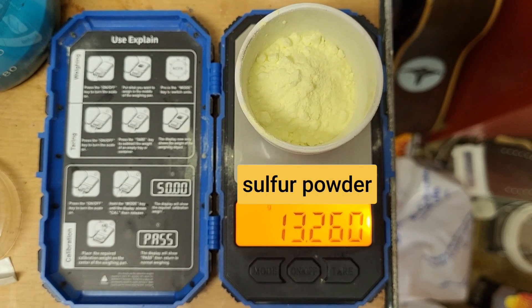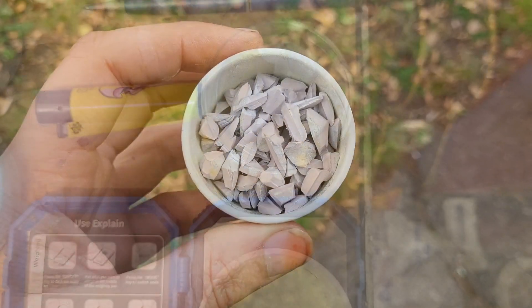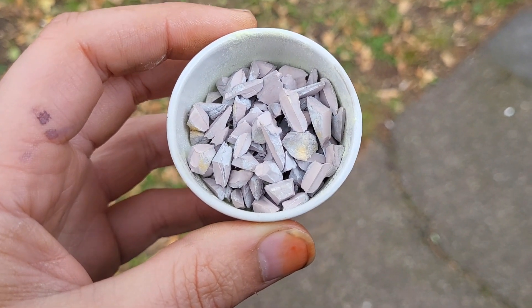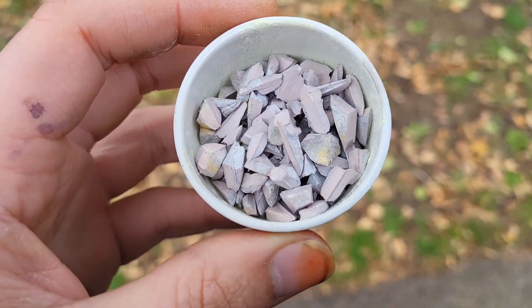13 grams of sulfur to 9 grams of sodium. I've chopped up the sodium, now I'm going to mix it with the sulfur underneath. It's a windy day, which is good.